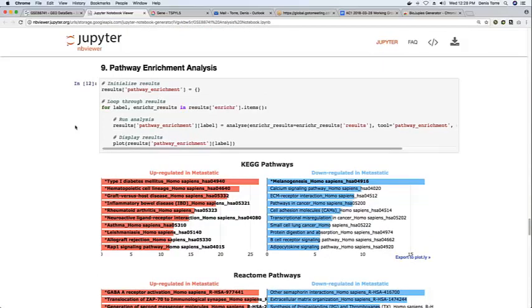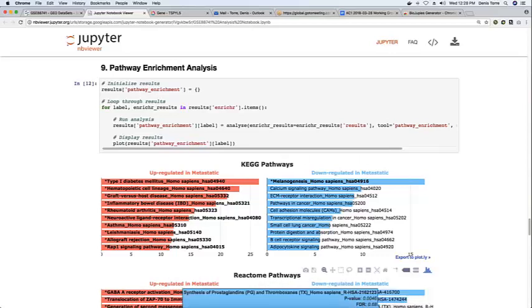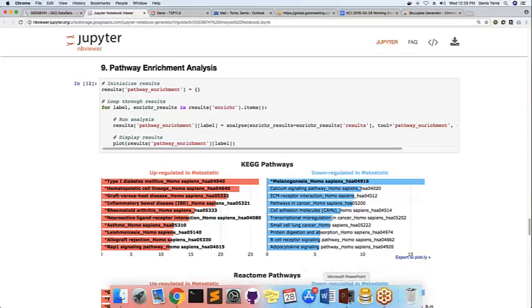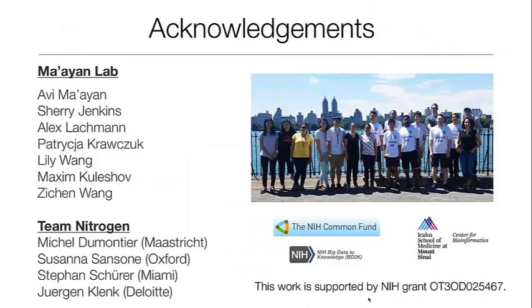And in the future, we also aim to implement a cloud-based system to allow users to launch these on the cloud and to reuse them and rerun them without necessarily having to use their own computational resources. So this is pretty much it.